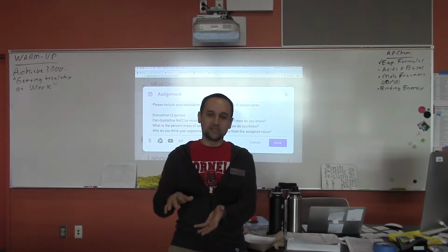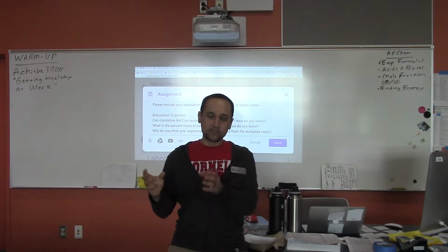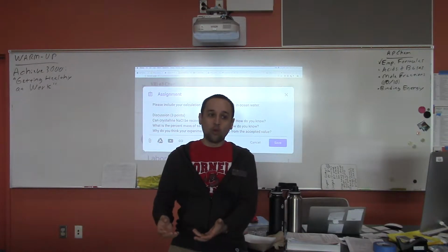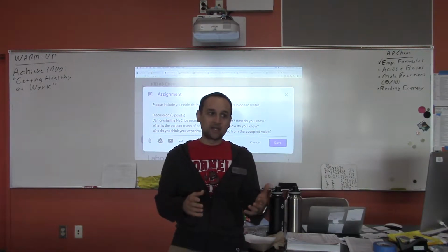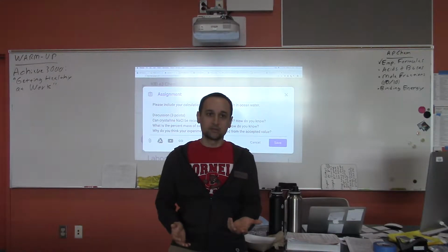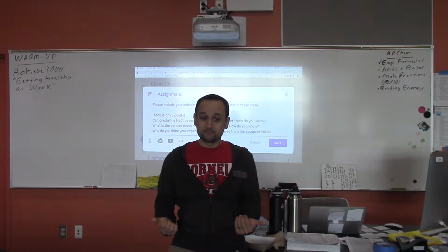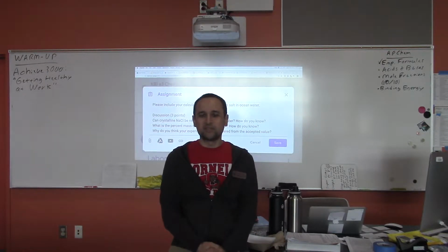So one mod comes in, does the experiment, the beakers evaporate, then the beakers have to be weighed, then they have to be cooled, then they have to be washed, then they have to be dried, then the next mod comes in, you repeat the process all over again, right? So we used a methodology that allowed us to get the work done. We didn't use a methodology that allowed us to get the most accurate result.